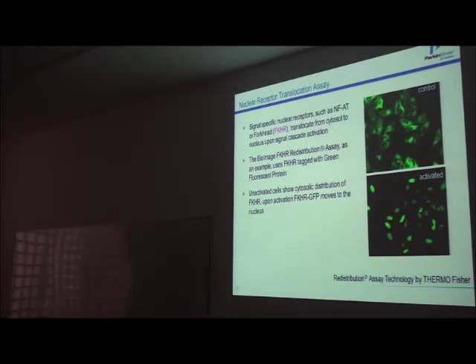I have some examples. So for translocation, usually you have your guide, for, let's say, protein, which is tagged with something fluorescent, and then you just want to follow this protein over the time under different conditions. And the protein probably goes from the cytosol, for instance, to the nucleus, vice versa, or from membrane to nucleus. That's something we can do easily, even without specific membrane staining. So FKHR is one example here.